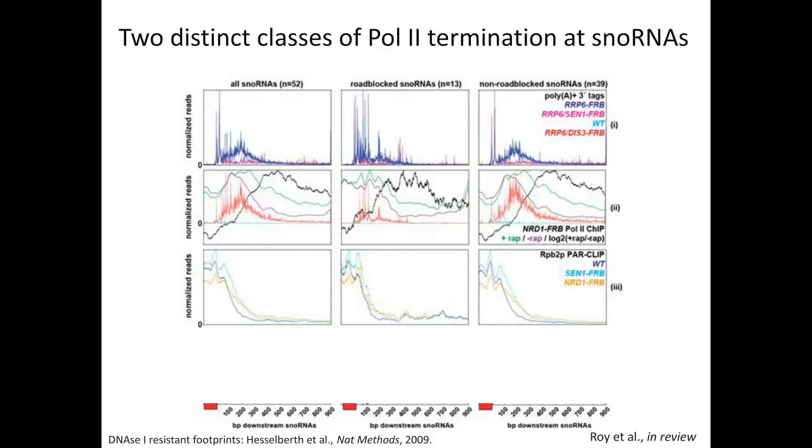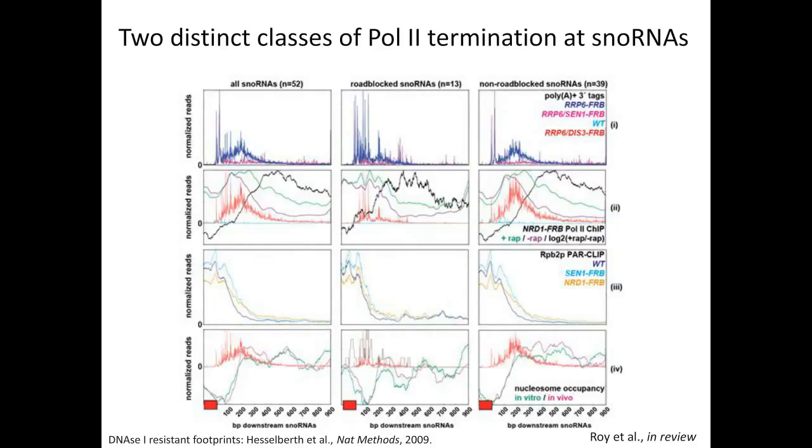And so what we could see is that as a class, the non-roadblocked snoRNAs without the DNA binding proteins downstream appear to be blocked by the nucleosome occupancy, whereas the roadblocked snoRNAs in the middle panel at the bottom contain these DNase-resistant footprints directly downstream of each peak. And so we could conclude that the NNS termination appears to require not only RNA binding signals, but also obstacles in the DNA, either DNA binding proteins or nucleosomes.